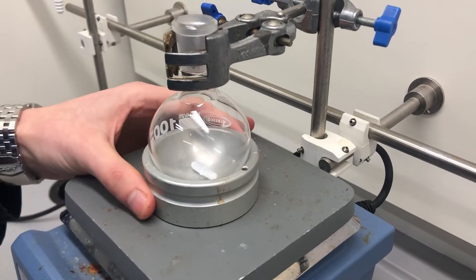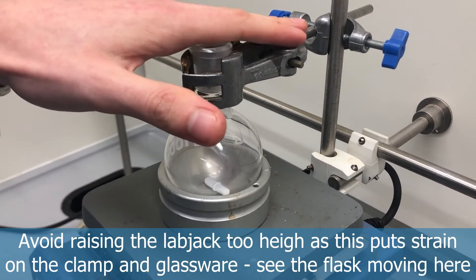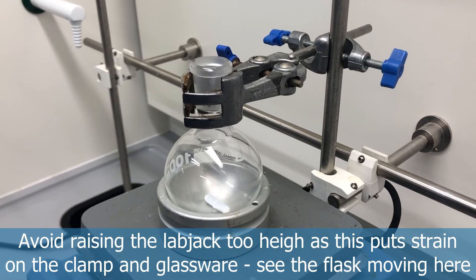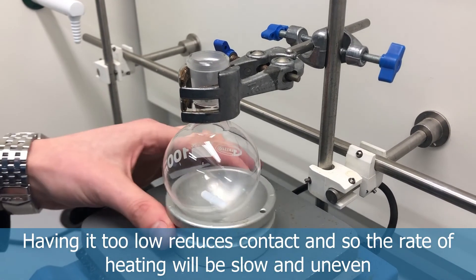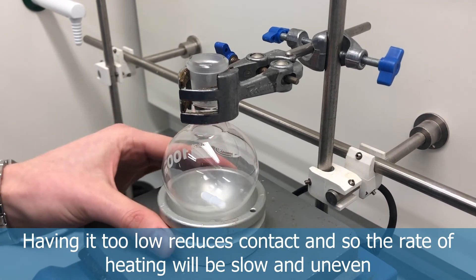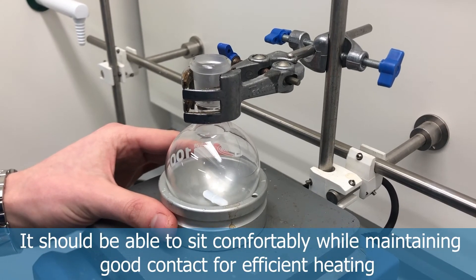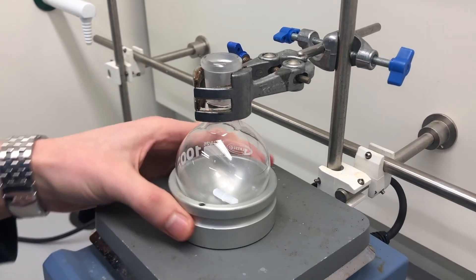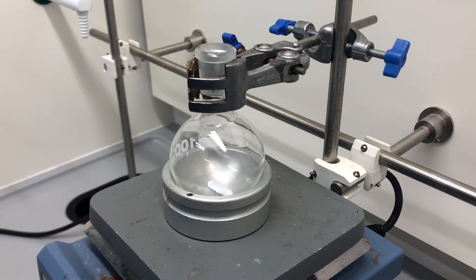It's important not to wind the lab jack up too high, as that puts strain on the glassware and the clamping apparatus — you can see the whole system moving when I raise the jack, which increases the risk of damage. Equally, if it's too low you'll have poor contact with the heating block, resulting in slow and uneven heating. The goal is to have it raised so there's good, comfortable contact for efficient heating, without straining the clamping arrangement or the glassware.